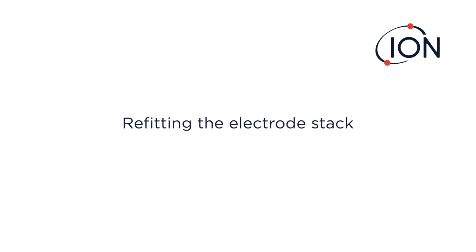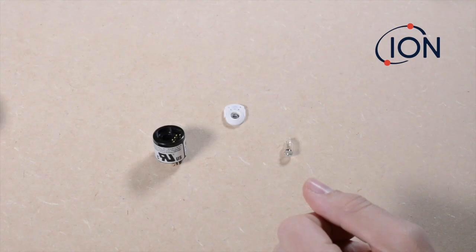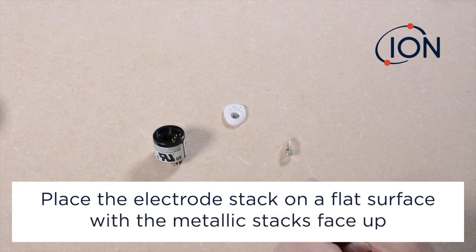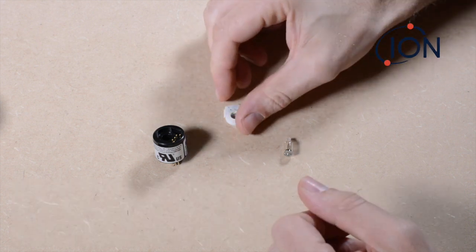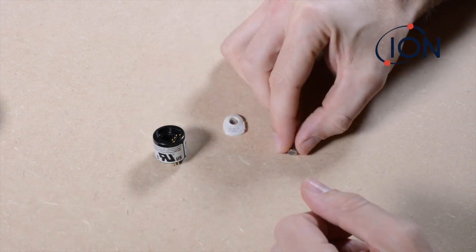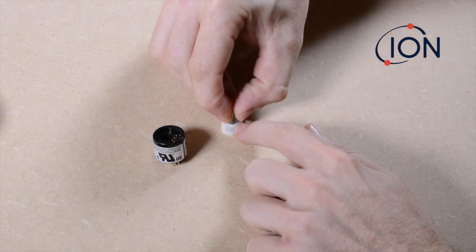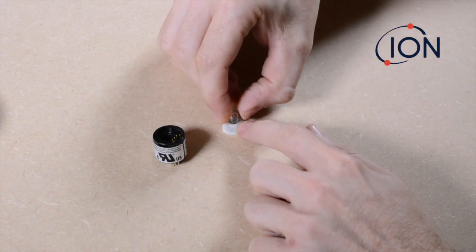The best method of fitting the electrode stack to ensure a good seal between lamp and stack is to firstly place the electrode stack on a flat surface with the metallic stacks face up. Next, supporting the stack in place, hold the lamp by the glass body and gently twist and push the lamp into the electrode stack.